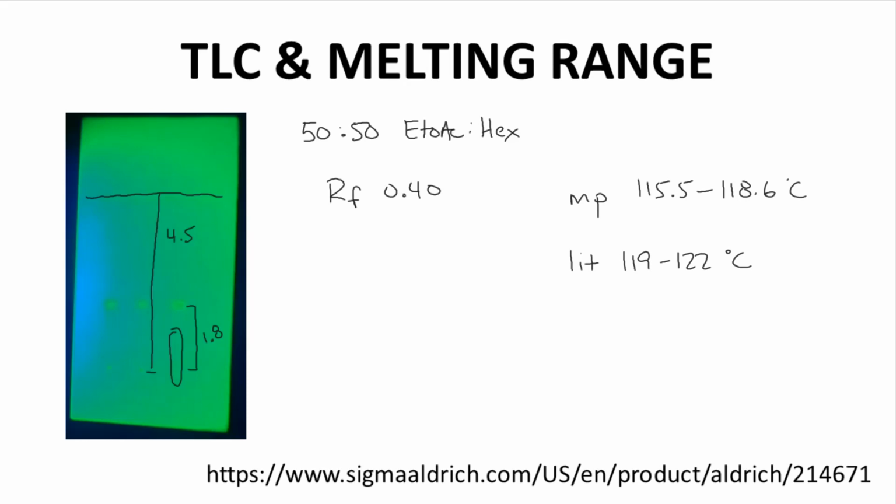The web page is at the bottom of the slide. So my observed melting range was a bit low. That's often the case for me. I can never seem to match a literature melting point. Normally, however, my products have fairly narrow melting ranges. A melting range of 3 degrees is getting rather broad, so this is additional evidence that the product contains some impurities. Let's see what the NMR looks like.